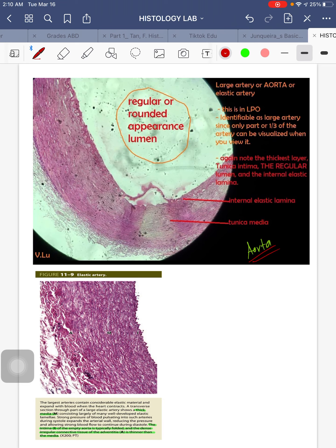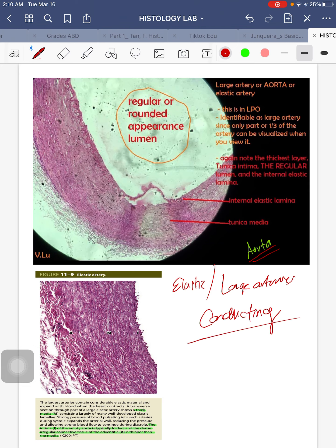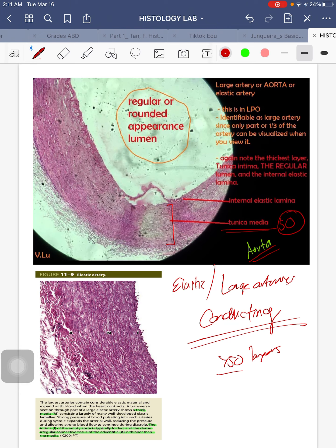This is your aorta — also known as elastic artery, large artery, or conducting artery. In your aorta, there are more than 50 layers of smooth muscles interspersed or alternating with elastic lamellae. We focus on the tunica media because it has the most layers. This is the LPO view — large arteries are identifiable since only about one-third of the artery can be visualized. Note the thickest layer: the tunica media.